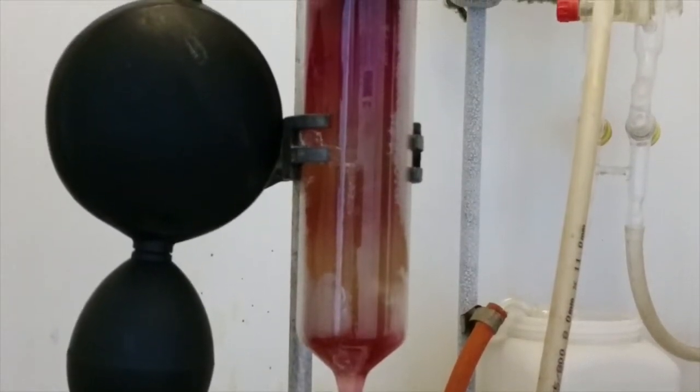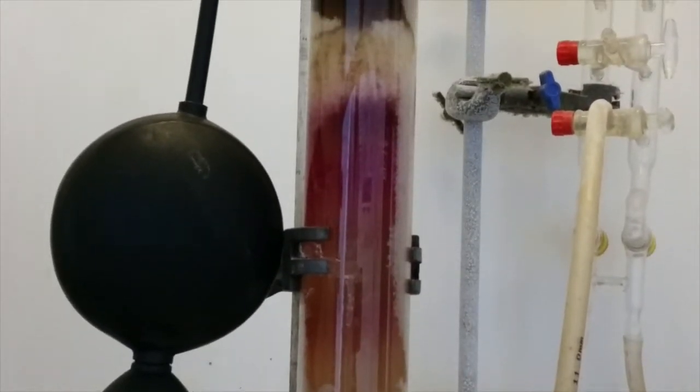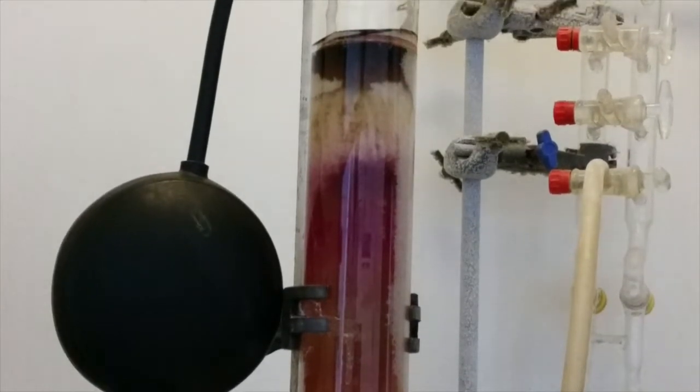Once you have confirmed the identity of the fractions you've collected you can vac down the ones that contain the product you want into one flask. This can then be precipitated to get the pure product.